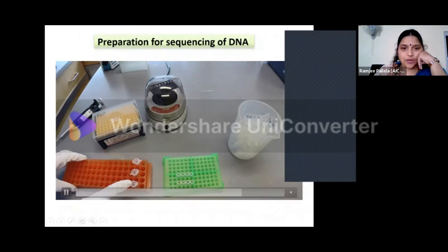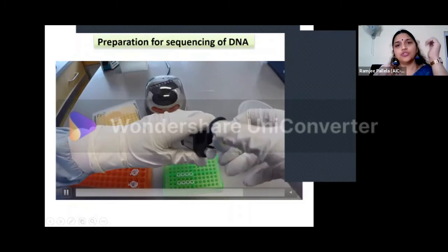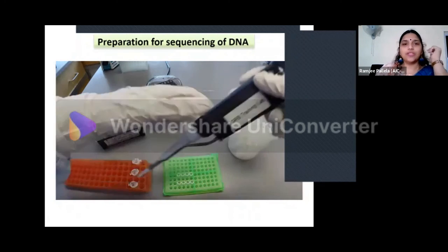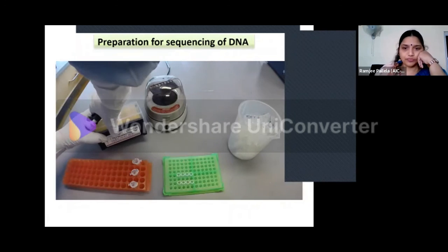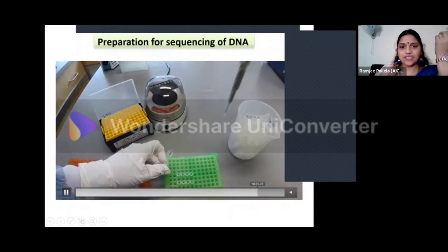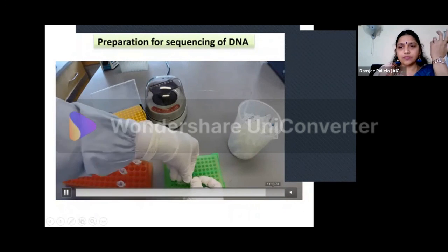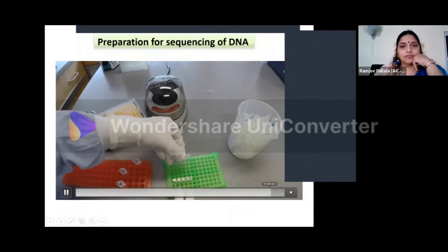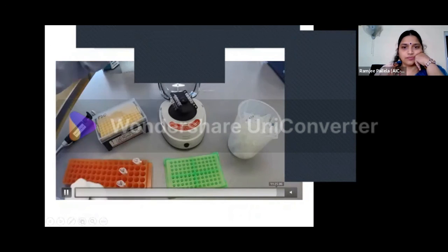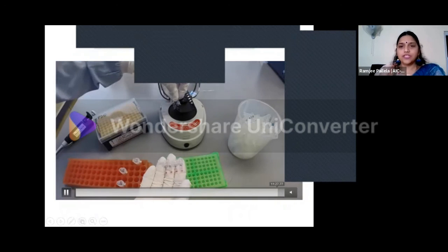Now when you have your reverse primer and forward primer together with the water, we have to mix all of these things together to be put in for our sequencing. Okay, so now in this we are putting our primers, forward primer, and then the reverse primer. Mix in all the samples thoroughly. And once you have mixed it, we keep it aside for our sequencing.